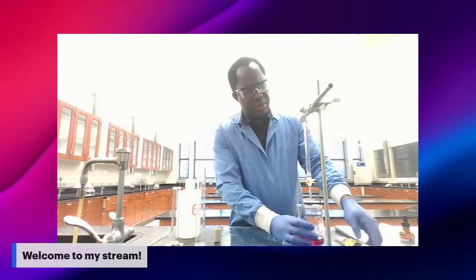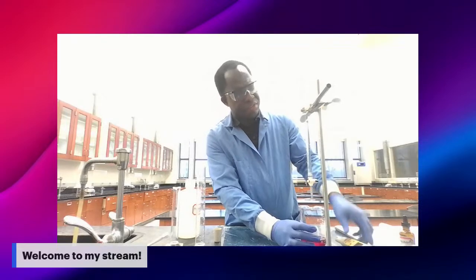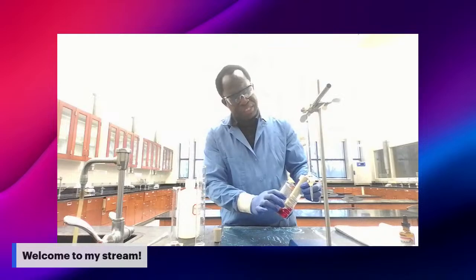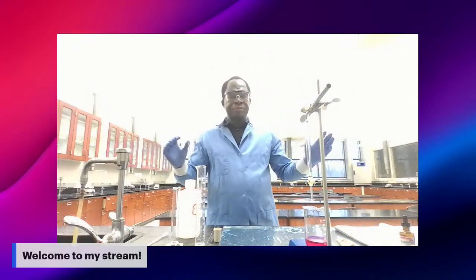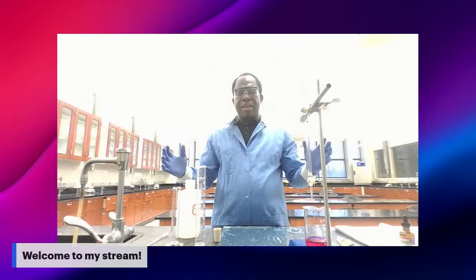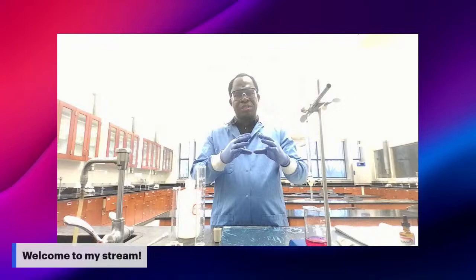Add another increment, and I measure another value: from 10.9, I move to 11. So you will notice that the change in your pH is not that wide.